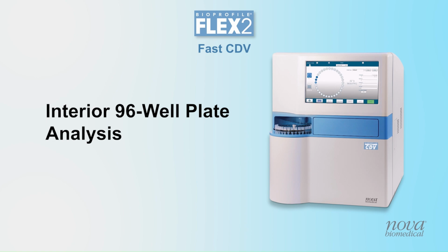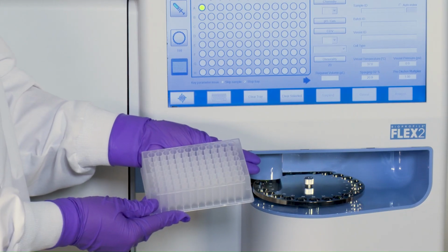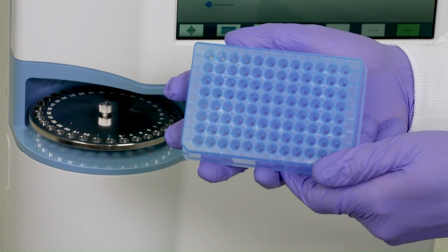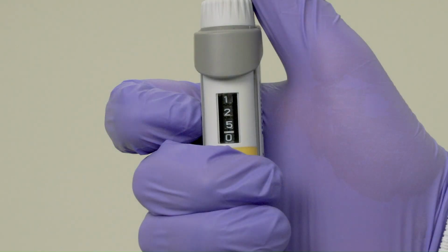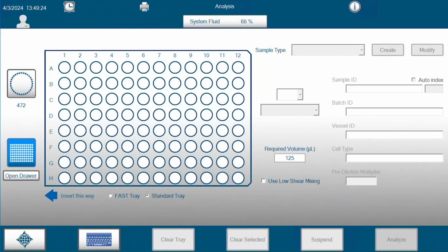For 96 well plate analysis, there are two plate options: the standard 96 well plate option and the NOVA Fast Tray, a 96 well plate developed by NOVA for the FAST CDV. The standard tray requires 125 microliters of sample in each well, while the NOVA Fast Tray requires just 100 microliters of sample in each well. Configuration is the same for both plate options.